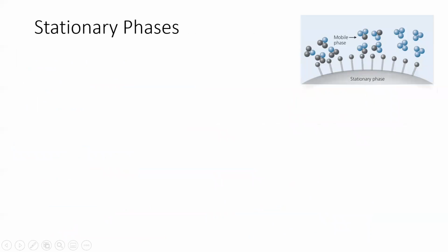All right, so we've talked a good bit about mobile phase and sort of what we do with it. We've talked about interpreting a chromatogram.